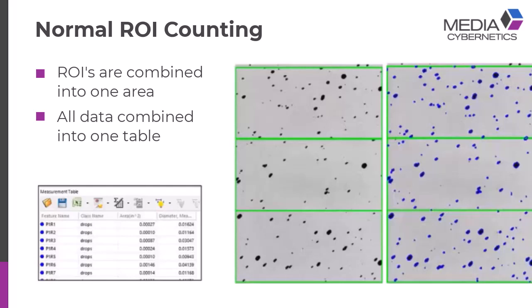You would set up your regions. Here I have some wetting paper with spray droplets, and maybe I want to do an analysis of these particular regions. If you have ROIs on the image and then just do a normal count, all the data would be included as one area within the data table. The only way to get further distribution within these regions is if you're using the parent-child app. This just combines all the data to one. The ROIs are really setting regions, inclusive areas where to measure, and that's all they did.